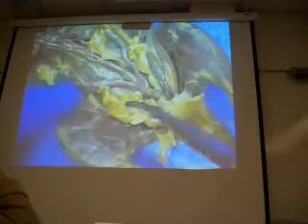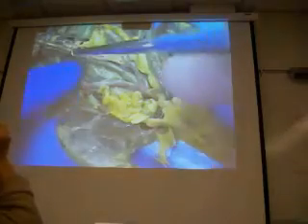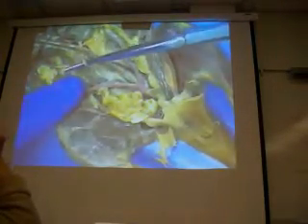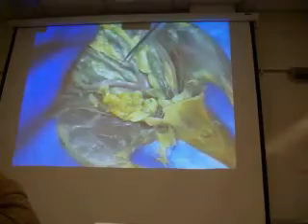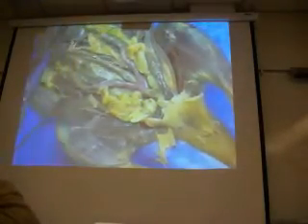The vessels going to and from the kidney are short. Those vessels are right here. I'll dissect this more cleanly. You can see how, as I lift up on this, the kidney is kind of being tugged. That's the ureter. So on the lab practical, I'll make sure that it's dissected out. So we've got the kidney, and then you have the suprarenal gland right up here. That's where your adrenaline is going to get produced.